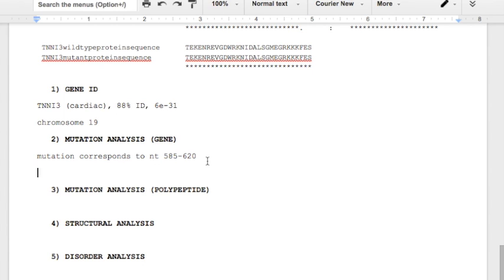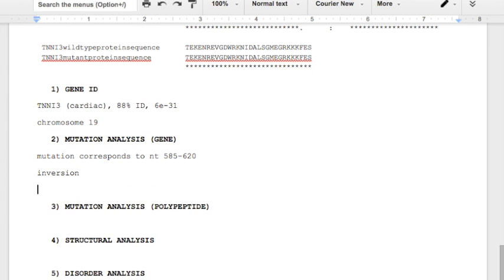Okay. What happened to this location? This was an inversion, though, again, your mutations will be a good deal easier to identify: insertions, deletions, single base pair changes, something of that nature.